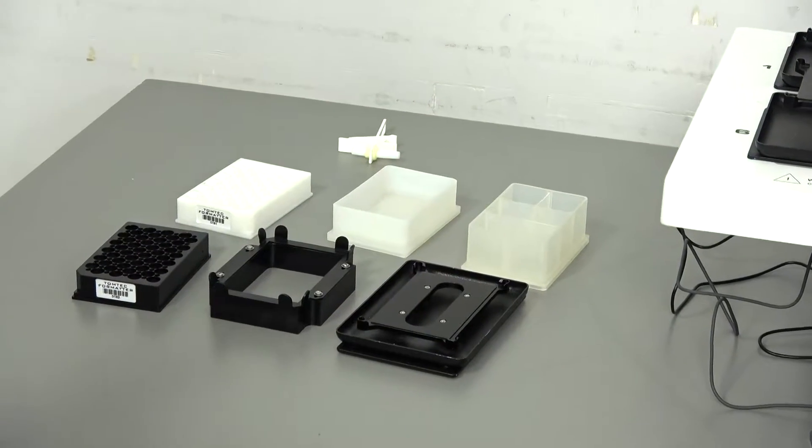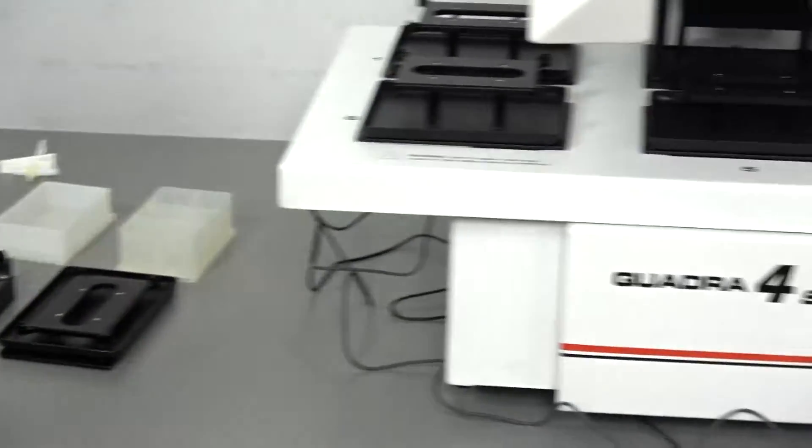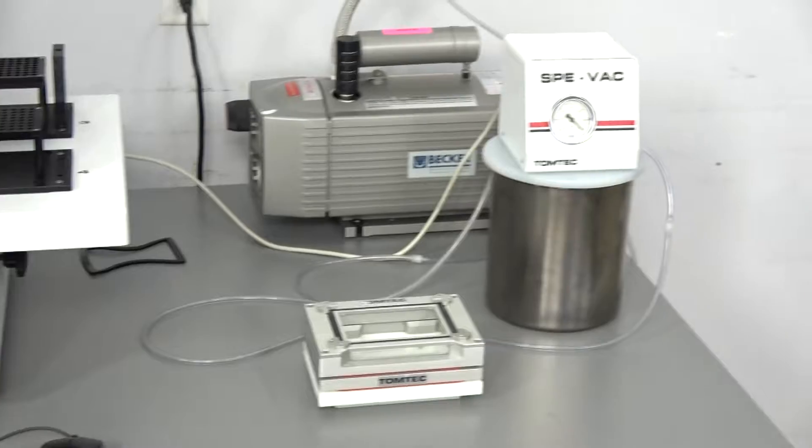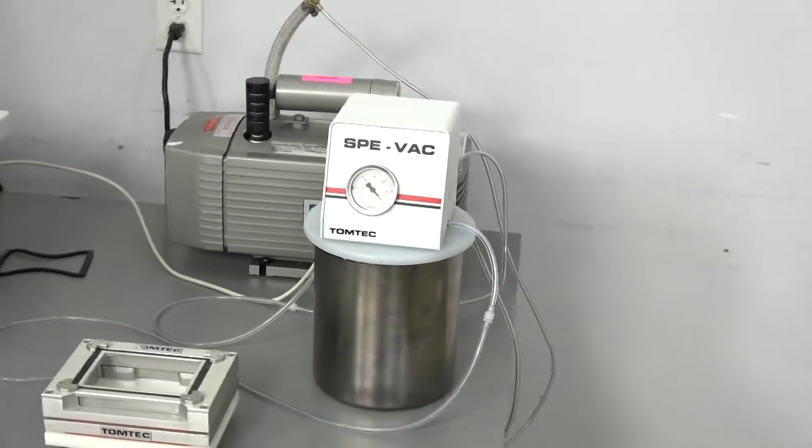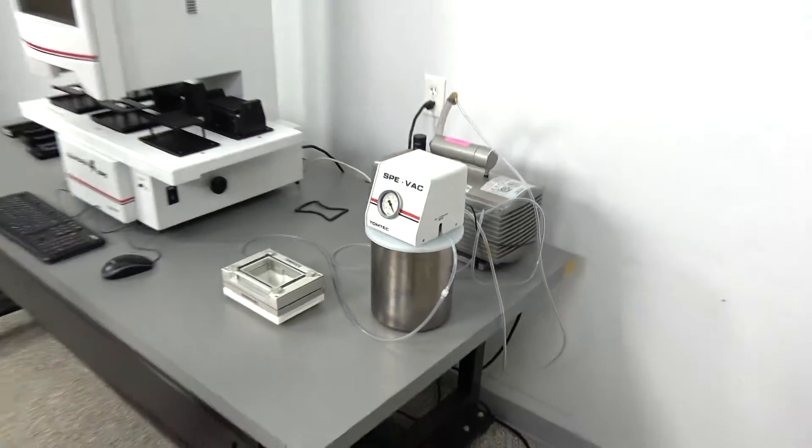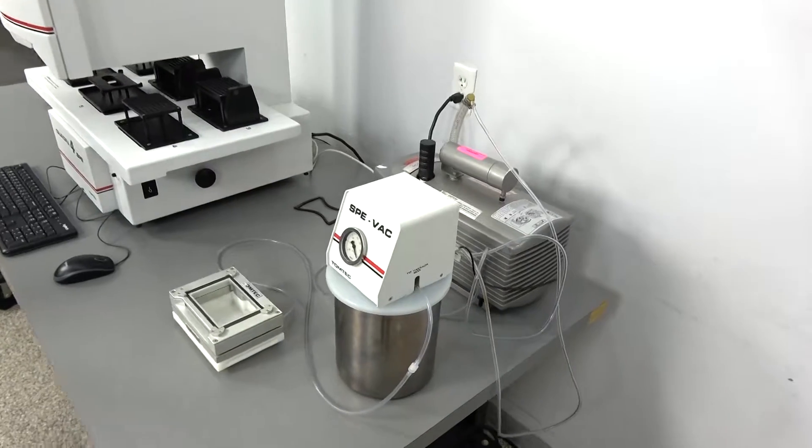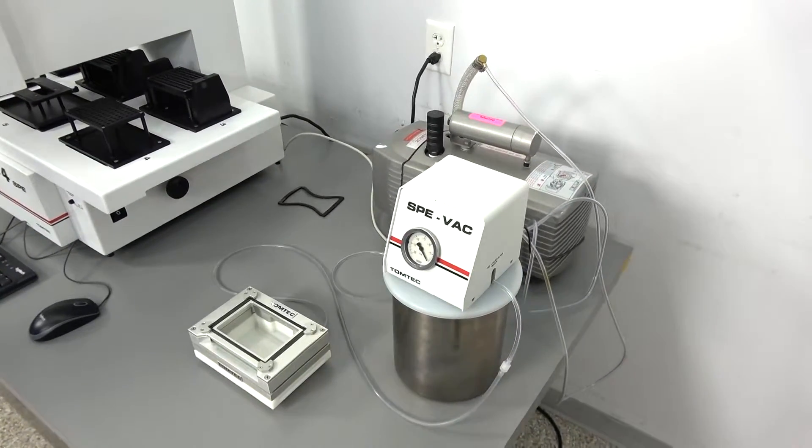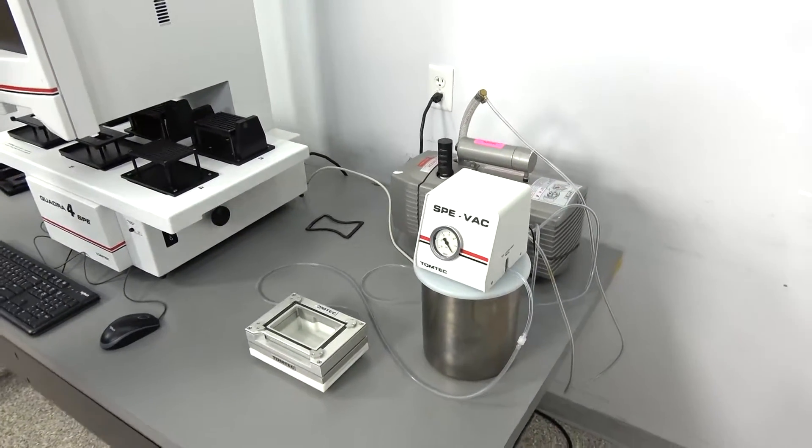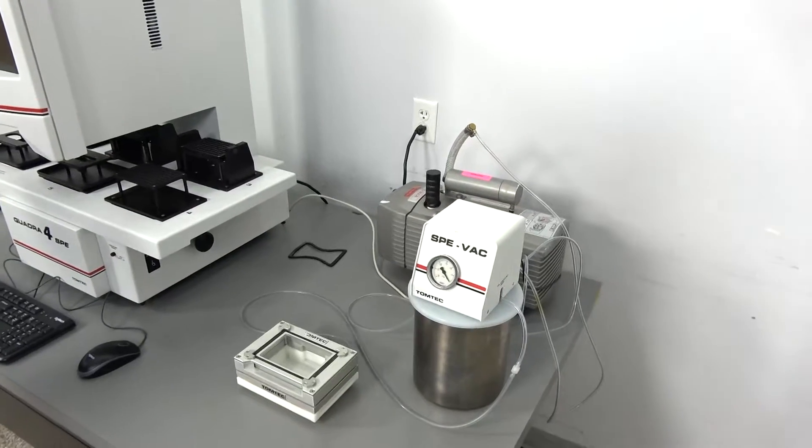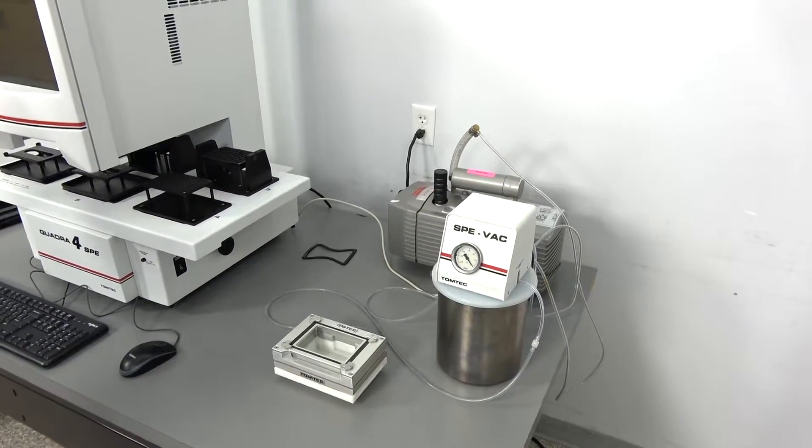One of the other things that we pair this system with is the TomTek VacuBox system. This one has an automatic vac system and monitor of the vacuum. It monitors the waste system to see if it's full so that you don't overflow the waste system.